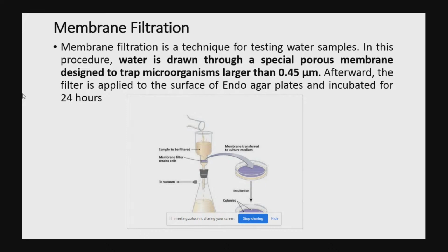In this technique, we use a membrane filter, and using a membrane filtration assembly, we place that membrane into the assembly. First of all, we pre-wet the membrane using a solution like 0.1% peptone, and after that we filter the product, which is easily filterable. After filtration, we give some desired washing, take that membrane and transfer it onto the agar media. After transferring, we incubate the plate at the desired temperature for growth of the microorganisms.